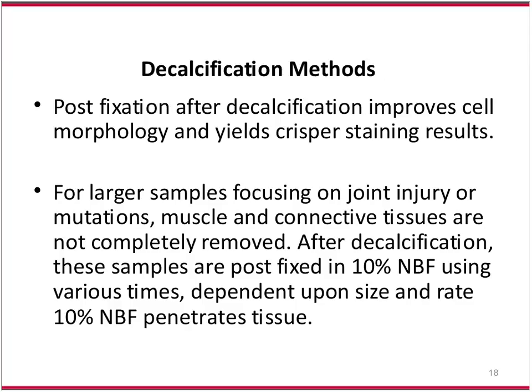We changed the formalin daily, and now we used EDTA for 7 days or 2 weeks. But that's not always the case. So I try very hard, which doesn't always work, but I ask that people bring samples to us right out of fix, and then we go from there in the process forward till we cut and stain at the end. That's not always an option. So if something comes to me, even if they say, we've decalcified it, it's this, it's that, I still will put it in 10% NBF for a post-fixation step.